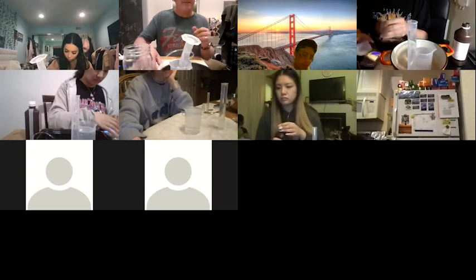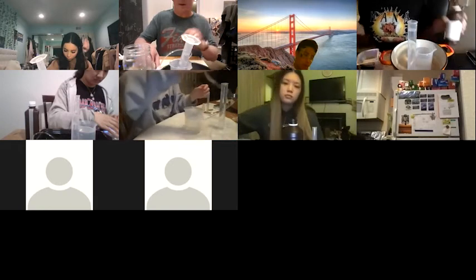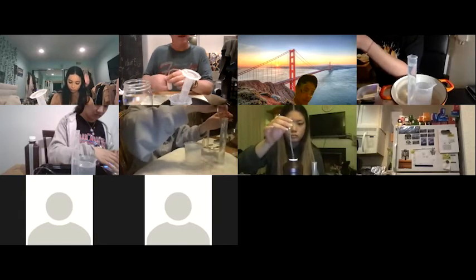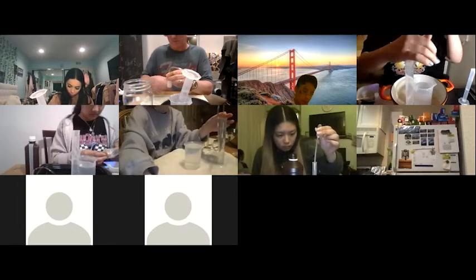So now that we've all sort of done one, what's been the average volume for 1 mil of hydrogen peroxide? There's a little over 5 mils of gas.